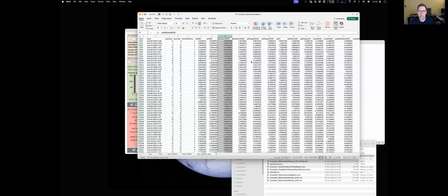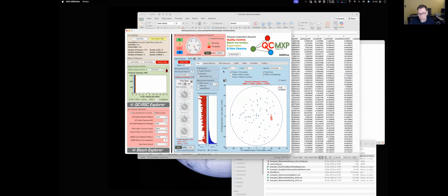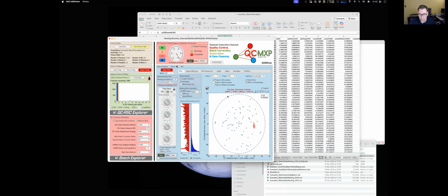So if we go back to the software again, so that's basically the data cleaning. And now we need just to look at the data and see how it's performed. So the first thing that I generally do is we'll plot a PCA plot. And here we've got the blue dots are the samples and the red dots the QCs. We can plot that as batches, so you can see that there's 2 batches, and you can see the different batch samples, the triangles you kind of see very well.